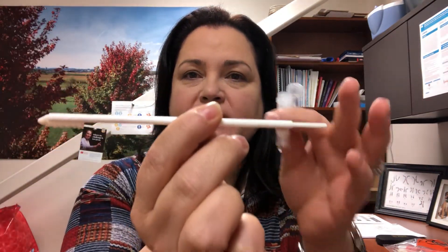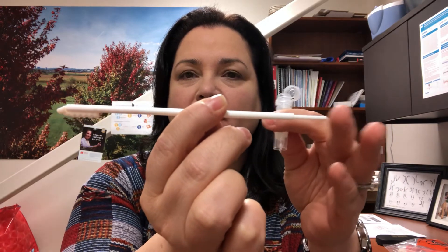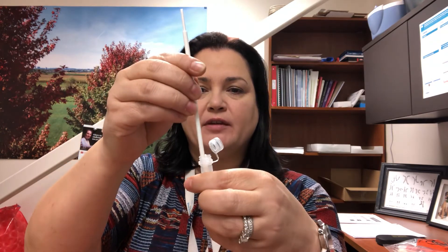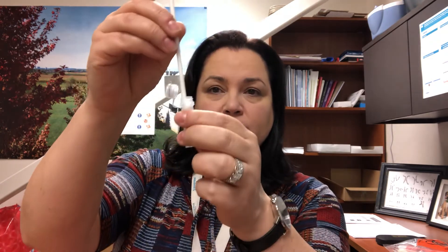Okay, so this part is going to go into the top of the tube. The nice thing about this swab is that there's a plunger on this end. What you'll want to do is put the soft part of the swab into the tube and press down, and you'll see the soft part is now inside the tube. The handle can be thrown away.